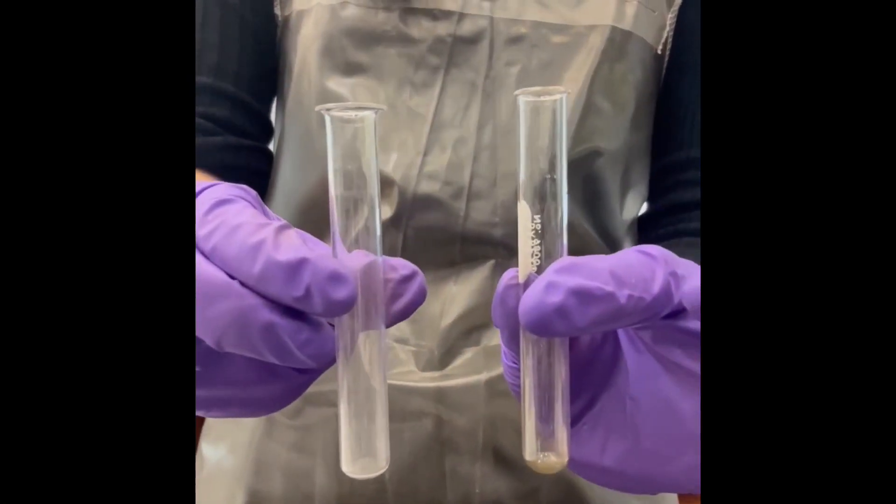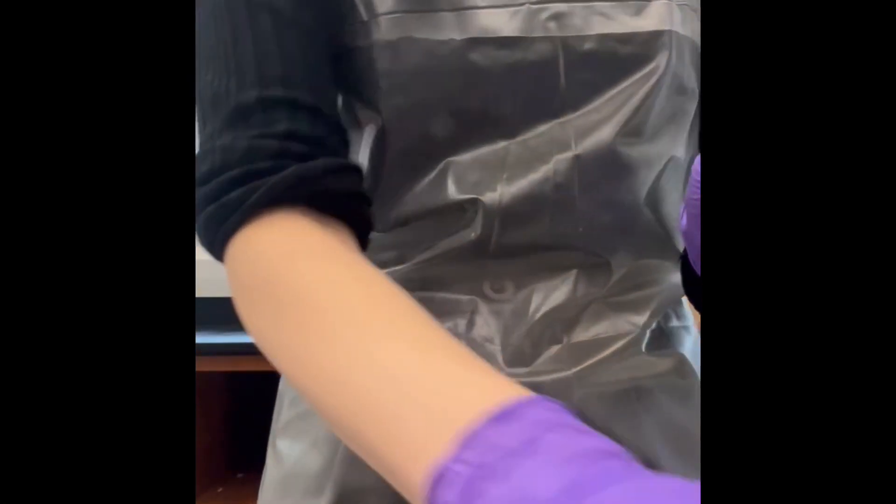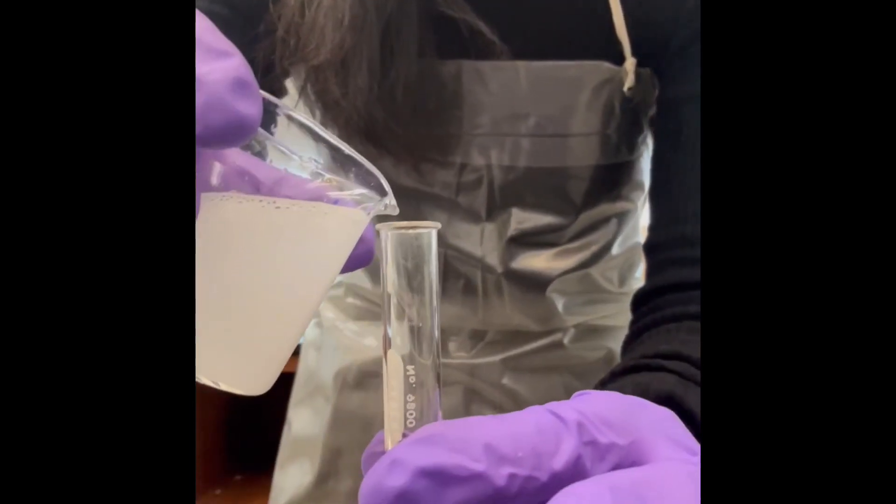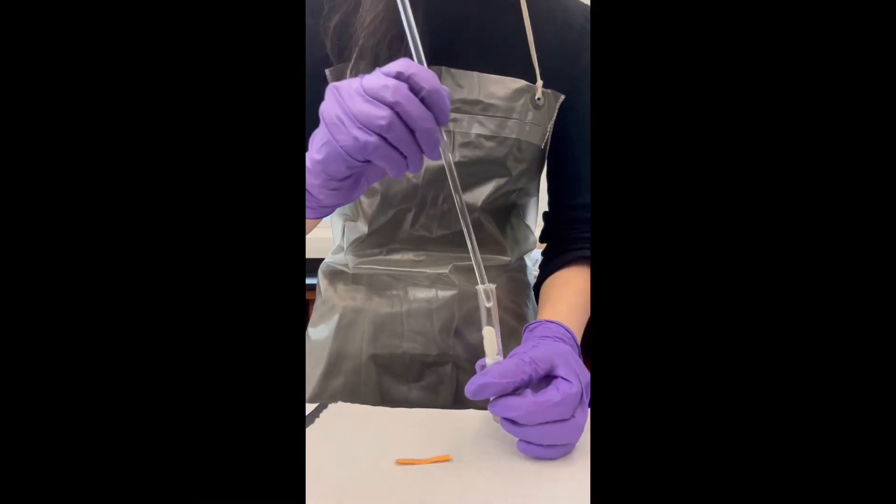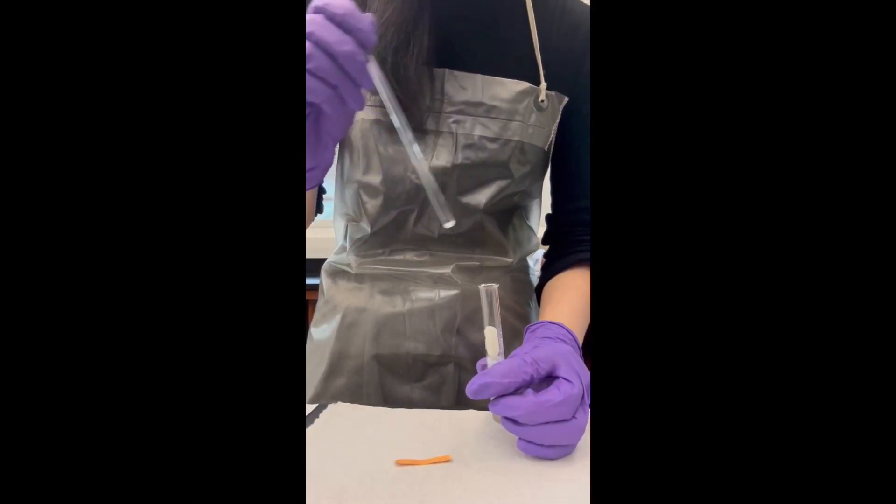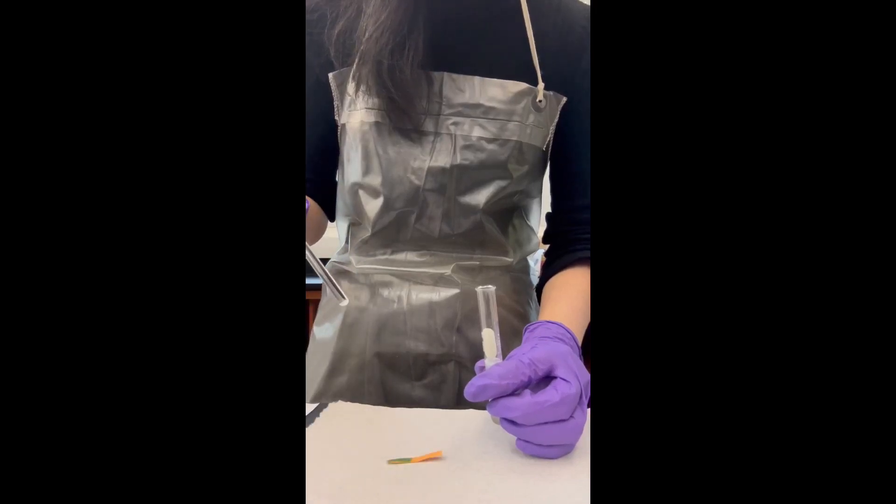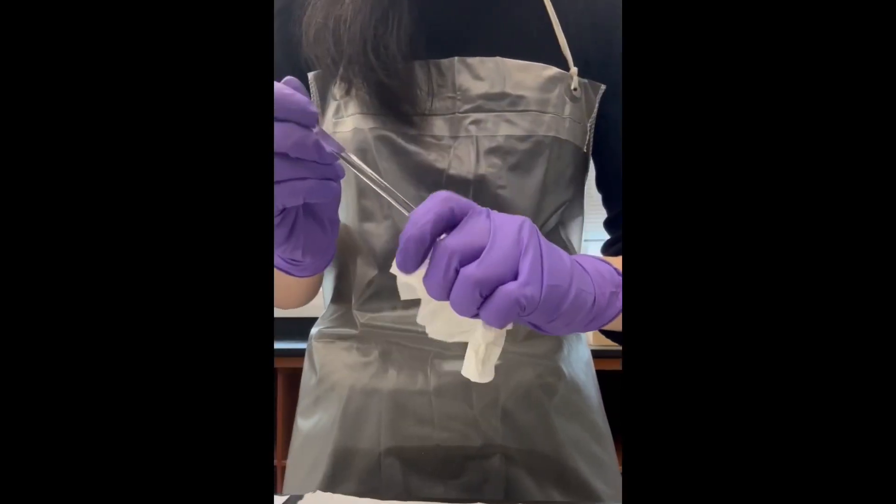For the pH test, collect two dry and clean small test tubes and pour about 5 milliliters of each solution into a test tube. Dip the stirring rod into each solution and touch the stirring rod onto a small piece of pH paper, not litmus paper, and record the pH of the solution. Make sure to rinse and dry the stirring rod between each tube.